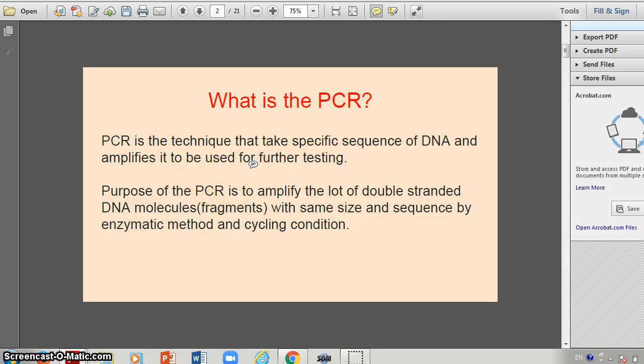After finishing this whole topic we are going to see the applications. Now you know one of the very important applications is disease diagnosis. In this PCR we are going to use, obviously, DNA molecules and the polymerase enzyme. This technique was first invented by the Nobel laureate Mullis in 1983. This Nobel Prize winner is from chemistry.